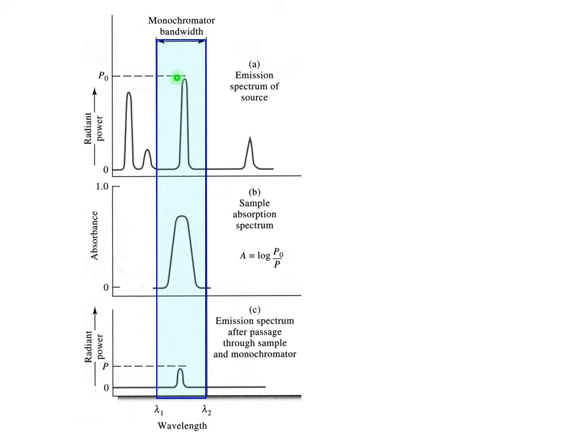These photons are absorbed by our flame, so we have exactly the same picture as with the usual absorption spectrum.